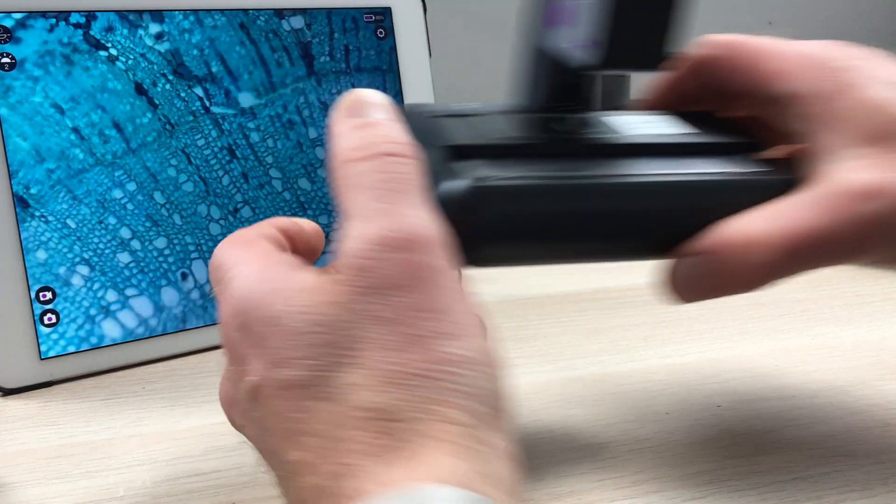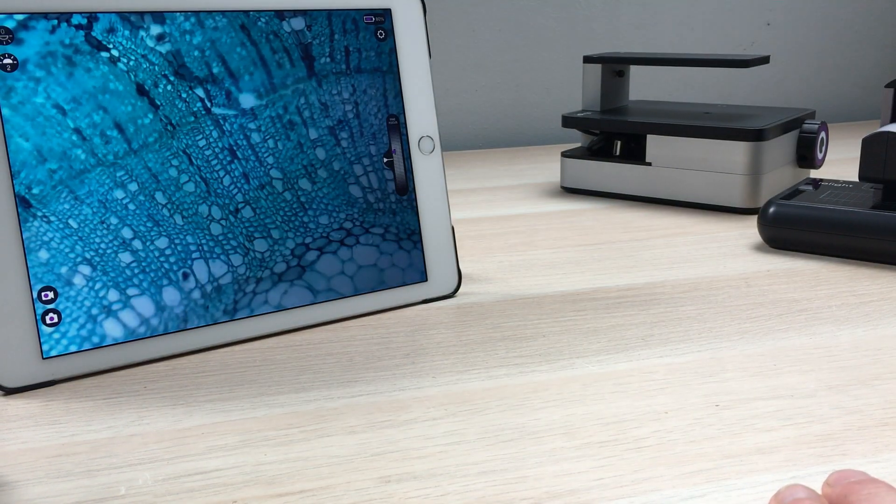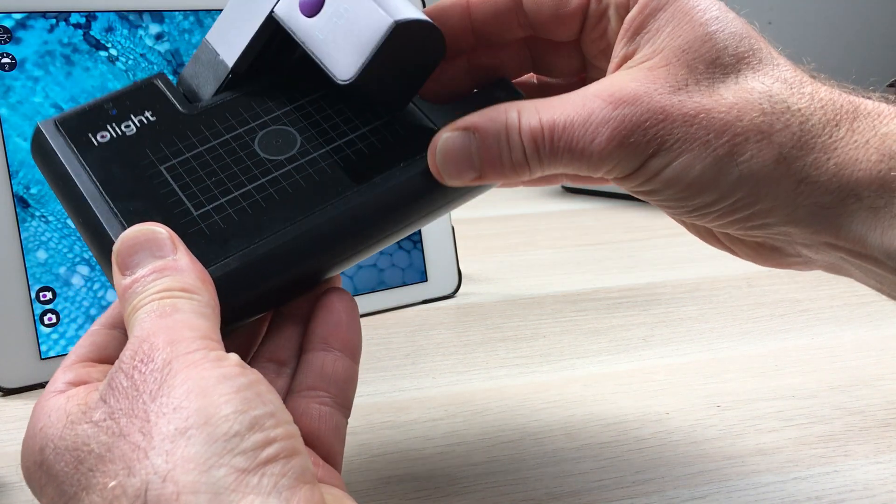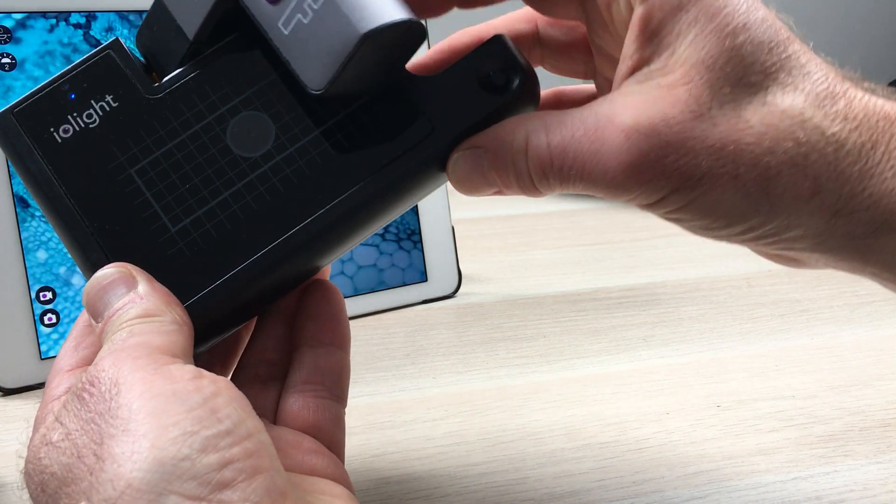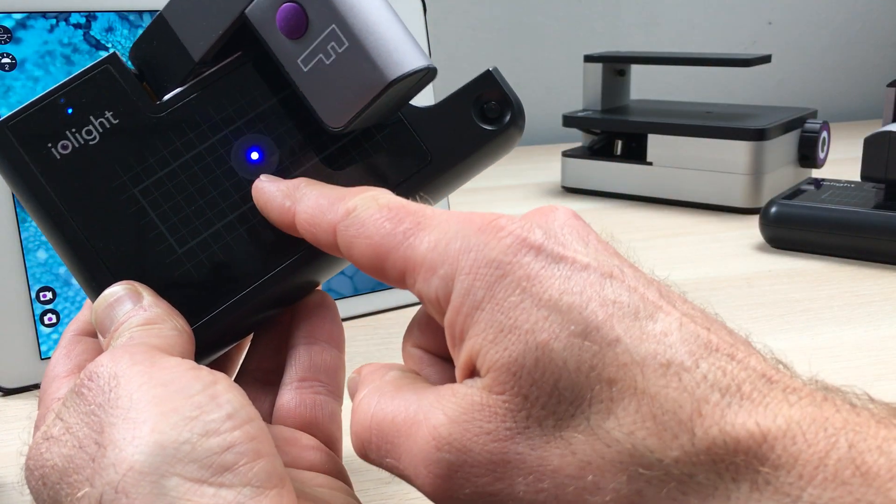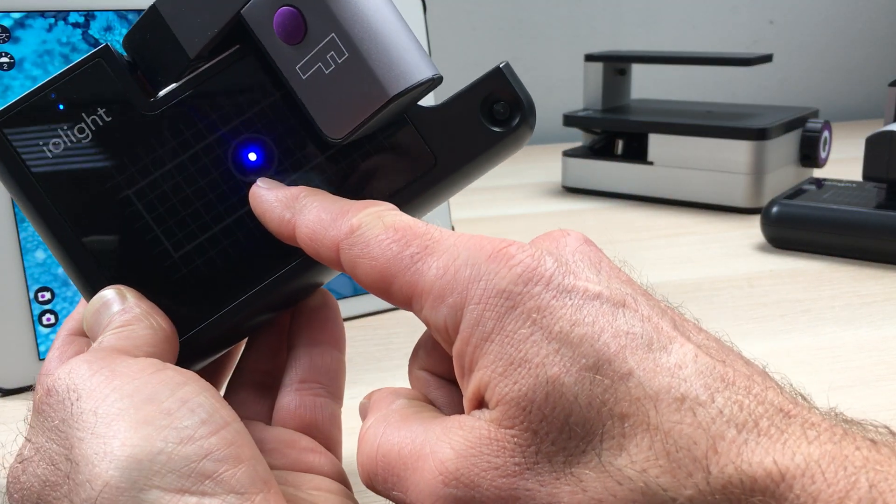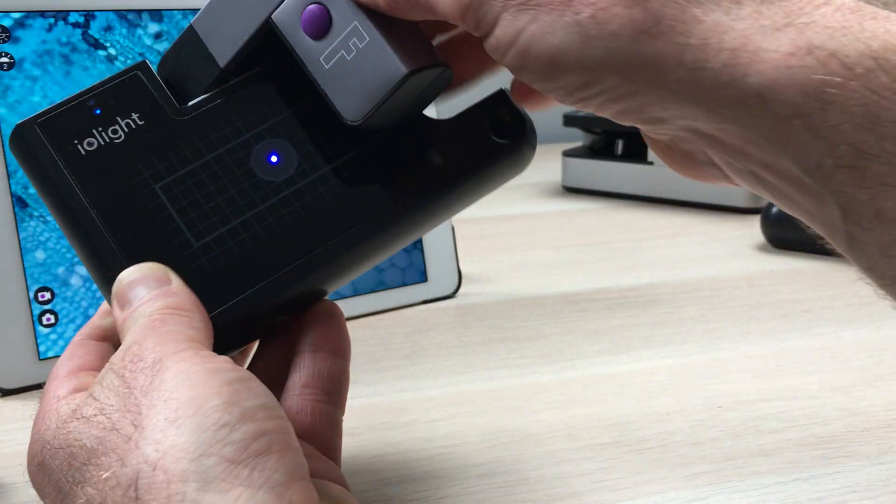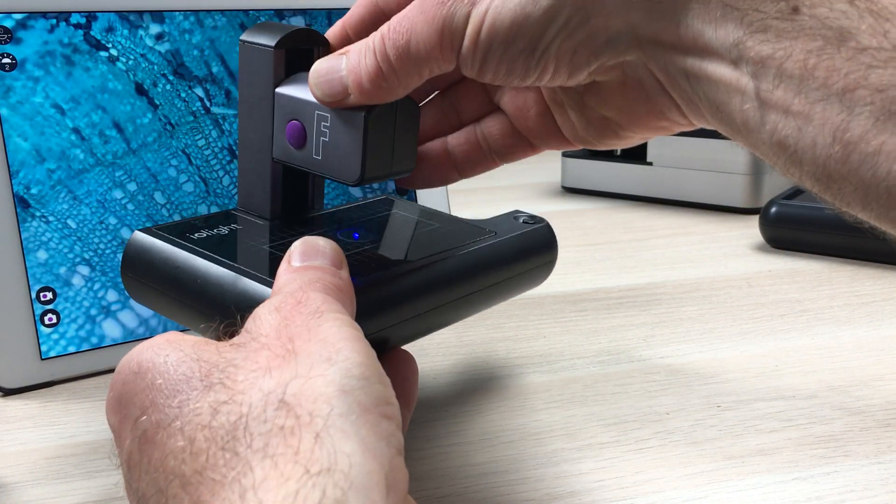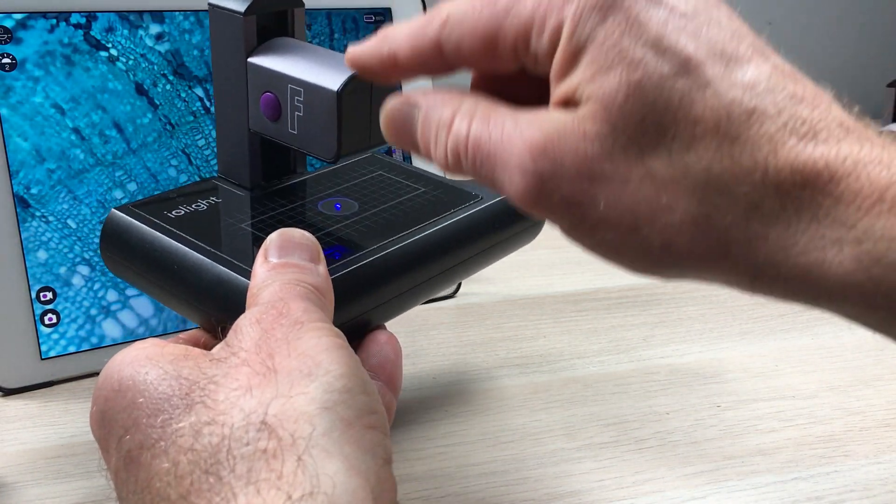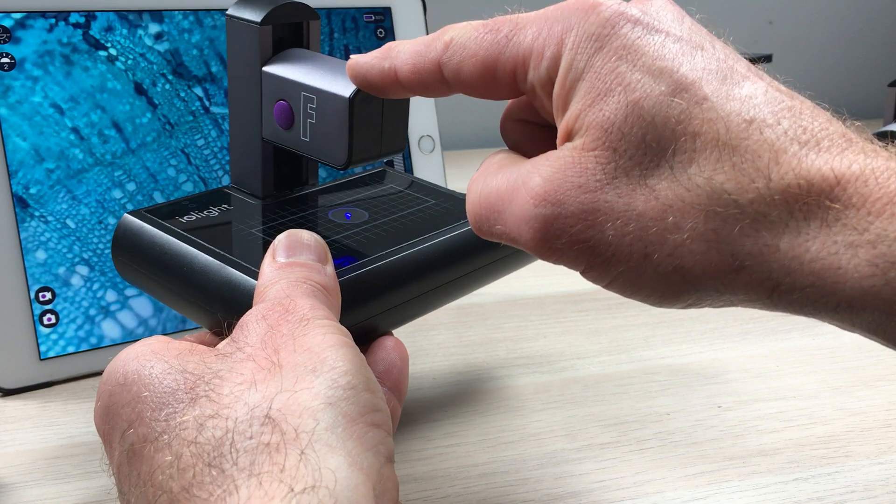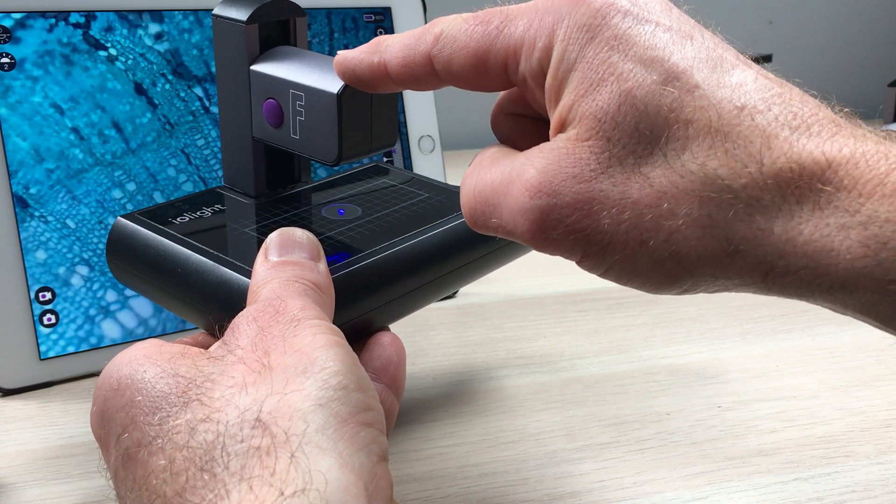The final version of the portable microscope is the fluorescent microscope. On this one here you have a bright blue illuminator and the microscope detects fluorescence at green and red wavelengths.